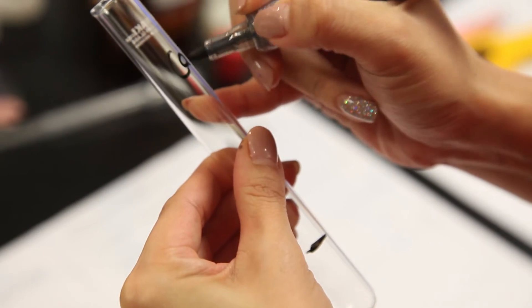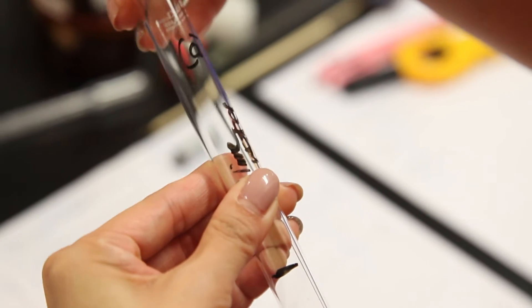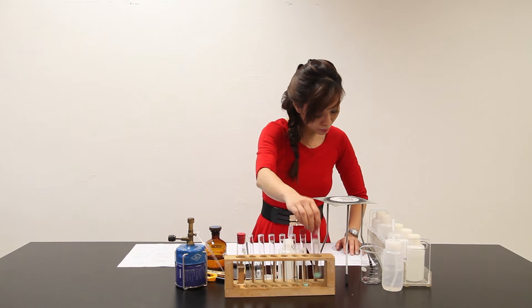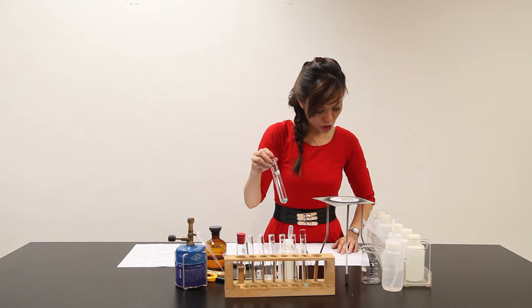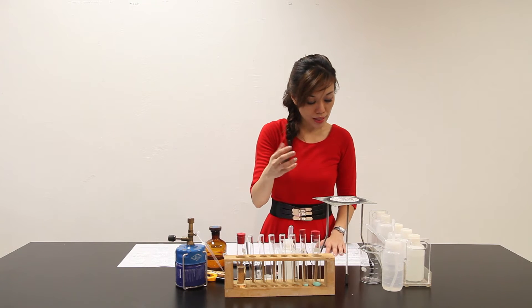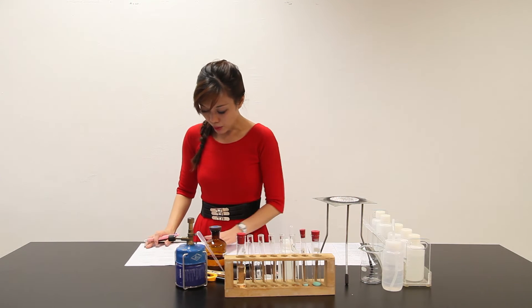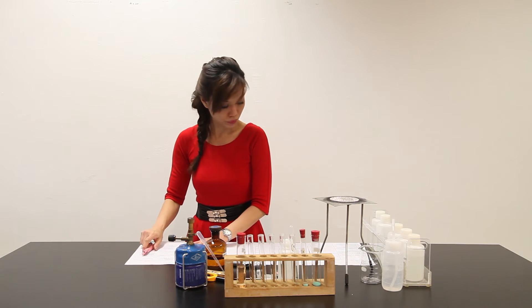Alright, let me label it as A, and this is lime water. Remove the stopper from the hard glass boiling tube labelled SORT X. Heat this boiling tube gently and then more strongly until no further changes are seen. You may see some condensation forming inside the boiling tube initially. The question says we are given lime water, but didn't specify what to do with it; however, the opening states we should test for any gases evolved — meaning with this lime water I am supposed to test for carbon dioxide. As noted in our practical notes, lime water is used to test for CO₂.